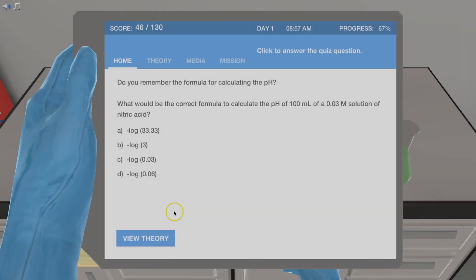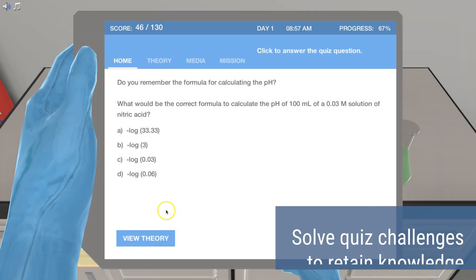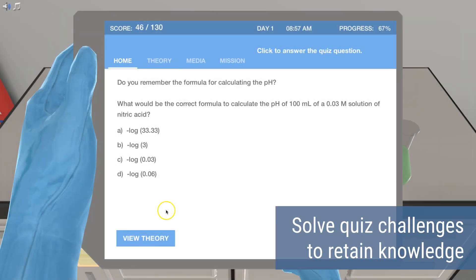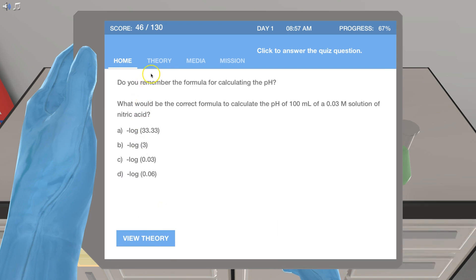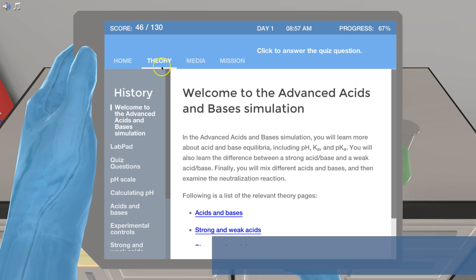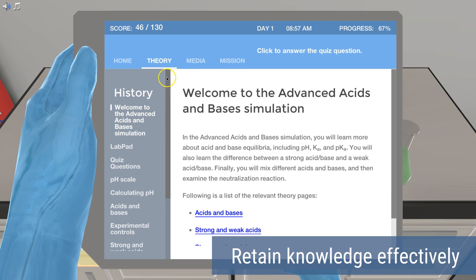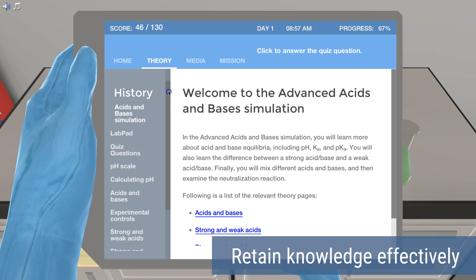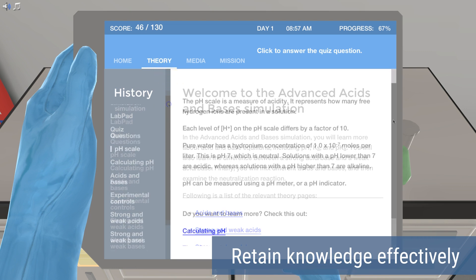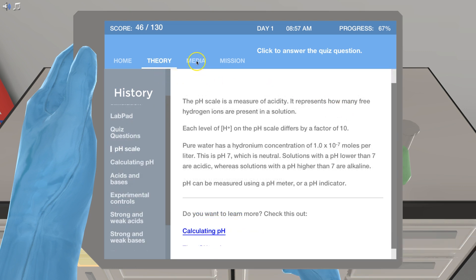Each simulation has quiz questions designed to help you learn and retain the new knowledge effectively. You will also have access to a full theory section, which provides you with relevant background information whenever needed.